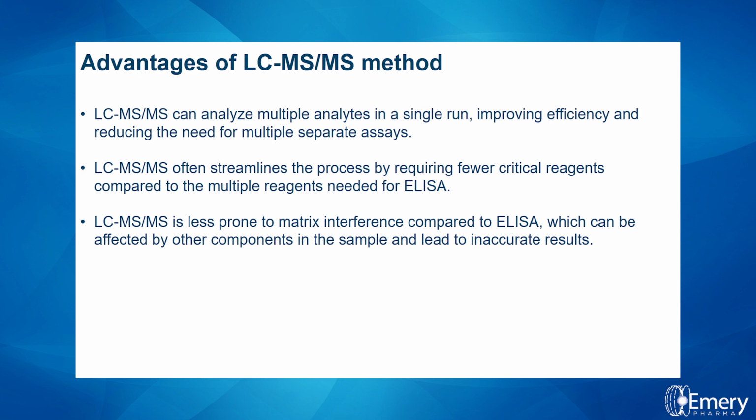LC-MS would require fewer critical reagents as compared to the multiple reagents needed for ELISA. Further, LC-MS is less prone to matrix interference as compared to ELISA, which can be affected by multiple components within the sample, leading to inaccurate results.